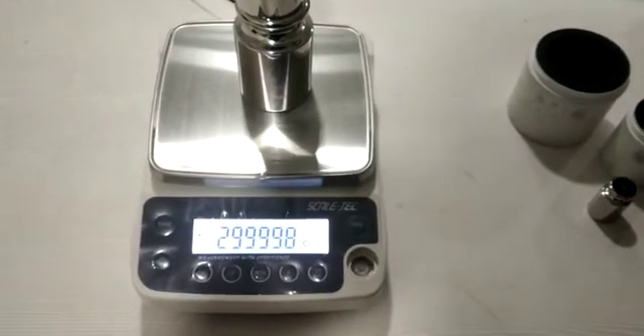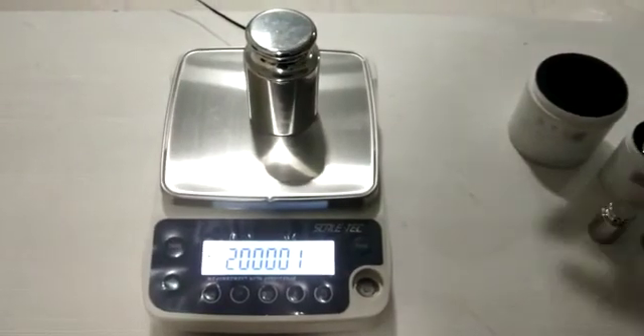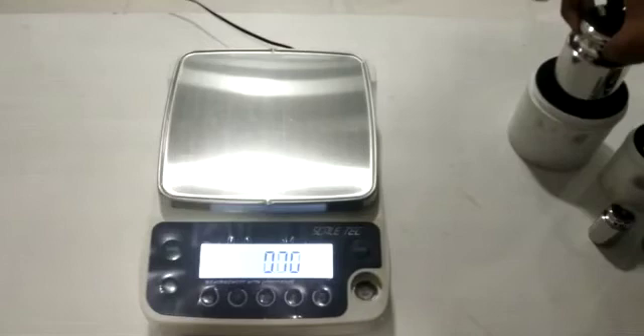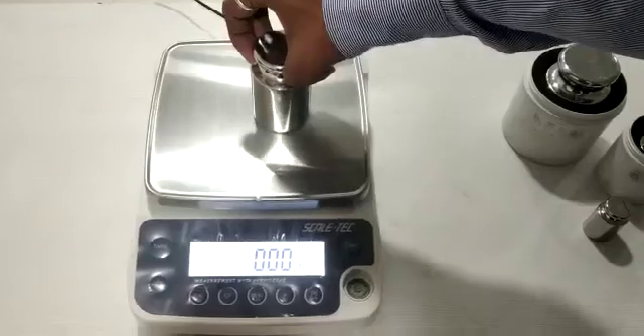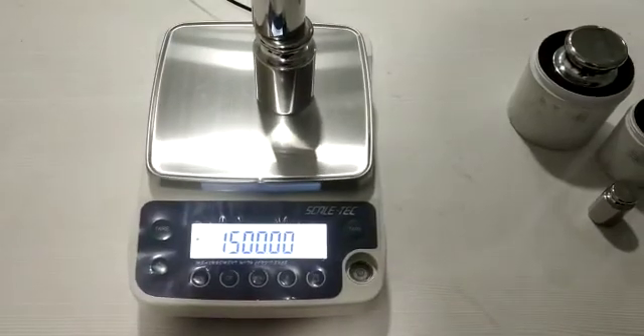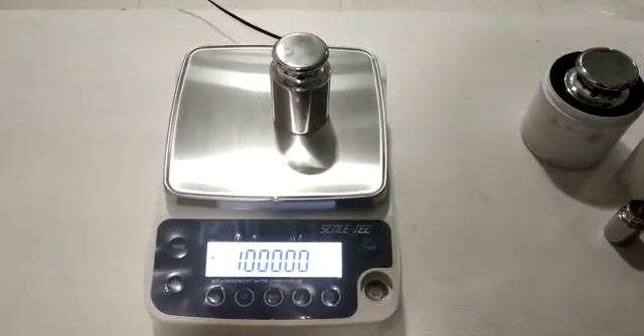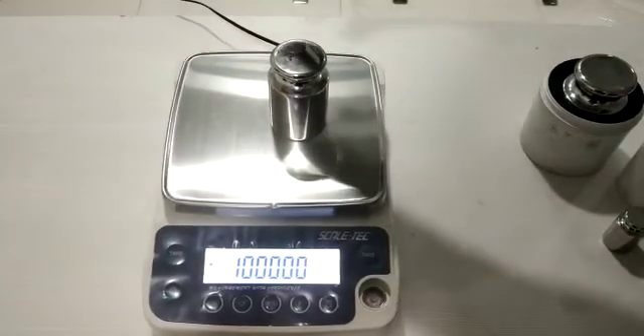Now let us move back down. First 2 kg, then 1.5 kg, then 1 kg.